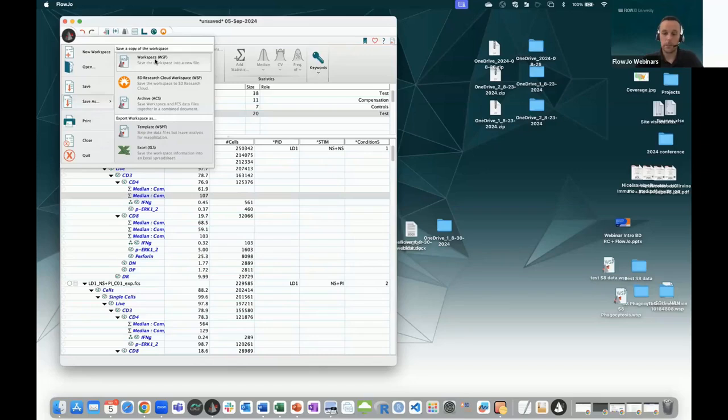which makes it really functional if you have a lot of data, because it doesn't require a lot of computer power to display a huge amount of data. So it's really a great way to save your data when you're still working on it.